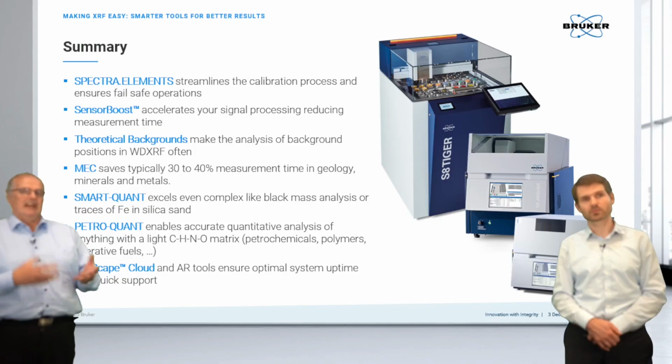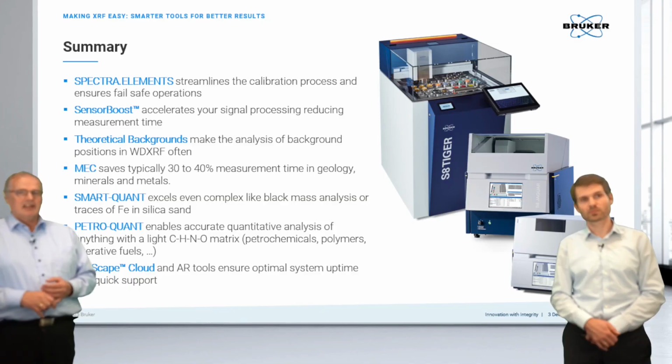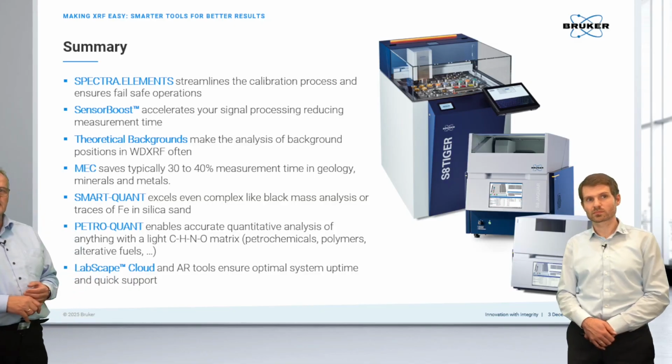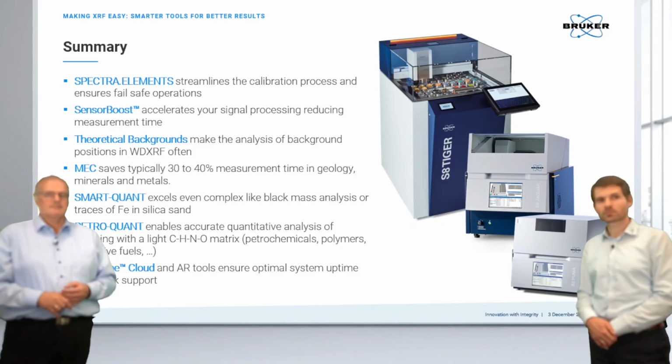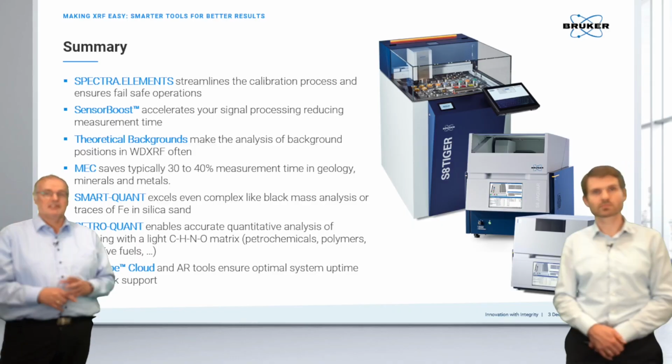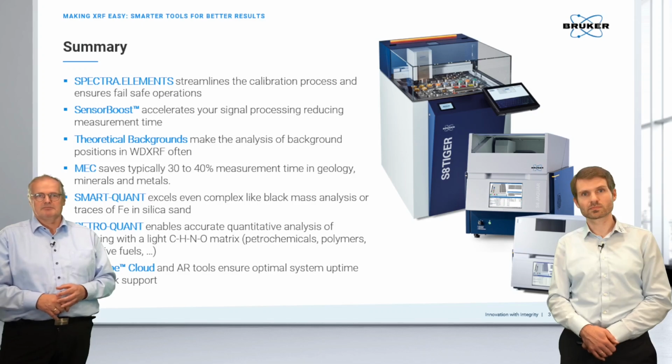But actually, it really helps to get data as good as a calibration. And then last but not least, especially when it comes to productivity, the LabScape Cloud helps us to have the instrument running operational 24/7 the entire year without any interruption.